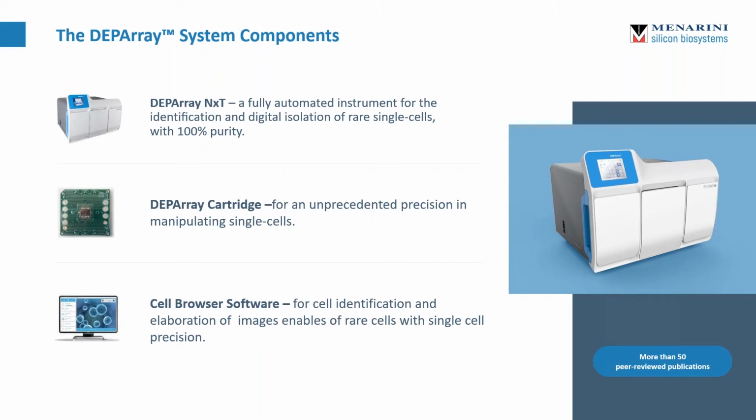And this slide shows the three most important components of the system, which are the instrument itself, the DEPArray. Everything is performed in the DEPArray cartridge, and then the software, the CellBrowser software, allows for imaging, analysis, and interpretation.